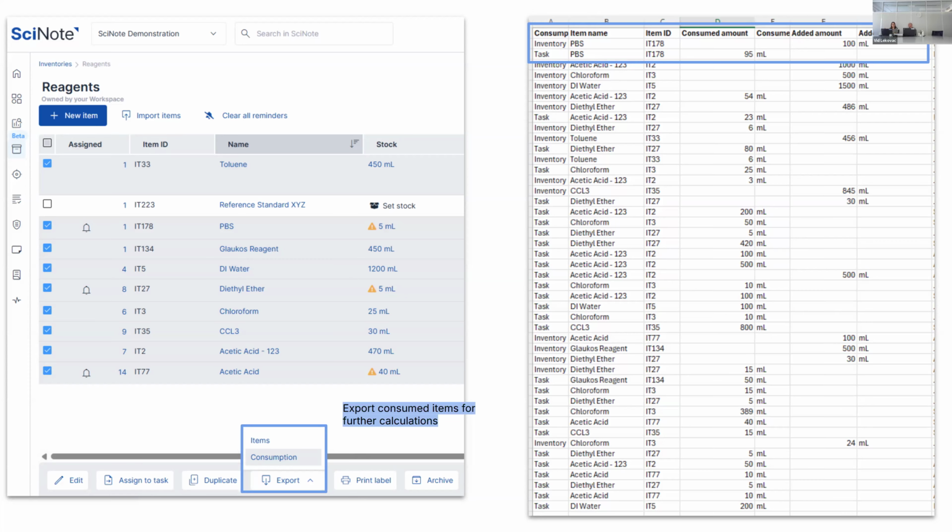So in this case, what you can do in SciNote is all of these CSV files and Excels can be very easily imported into SciNote. You can also use, as you can see on the screen, some predefined templates we prepared, but it's important that you create a centralized inventory. We've seen that this is one of the bigger mistakes our prospects and customers make: they don't standardize inventories.